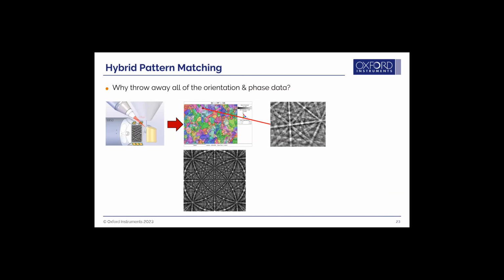You look at a given point. In this case, you have a starting point. This is a solved solution where you go, I think Hough indexing has told me quite a bit. I'm using a great example in the experimental data, but you can imagine a so-so one. What we're going to do is take the initial data that we got with the Hough transform and make subtle changes. So notice the orientation difference here.